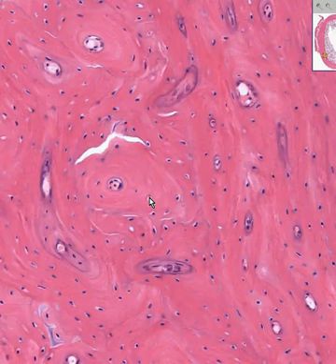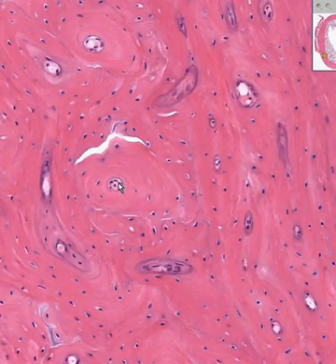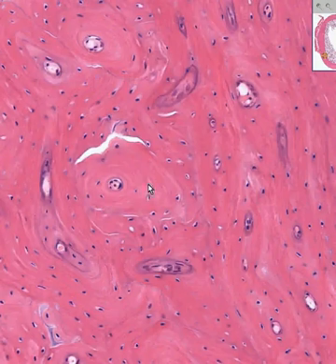So, to make a long story short, everything in the center of these concentric osteocytes are haversian canals. The Volkmann's canals, perhaps here, branch out at 90 degrees from the haversian canals. Here is the bone substance itself, hydroxyapatite, chiefly calcium phosphate.